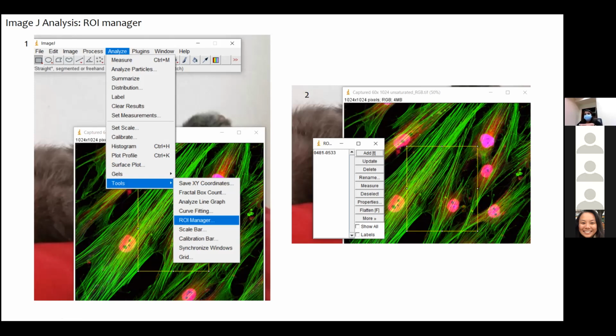So you want to always remember, if I'm showing this data, how is the reviewer going to look at it? Am I reporting the right thing? Because sometimes even when you're imaging, you don't realize what you've imaged is a false positive, and it doesn't click till the reviewer points it out to you, and then your entire story is just ruined. So when it comes to imaging, you have to be super careful.